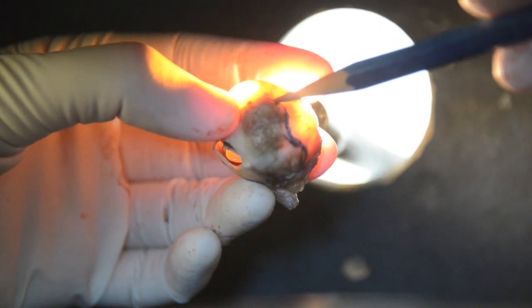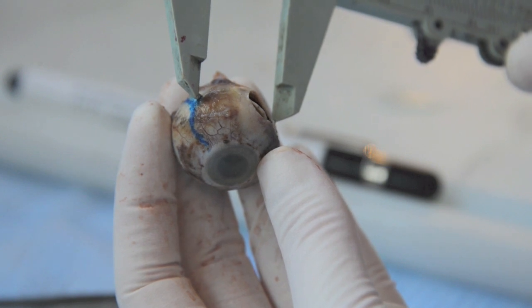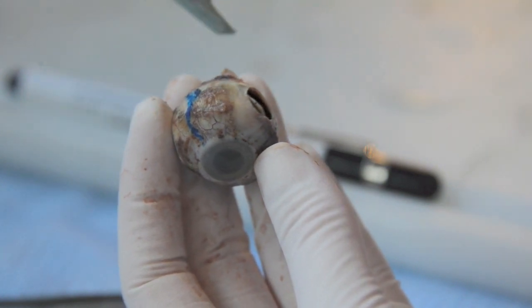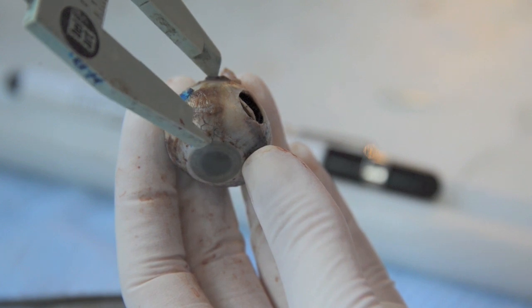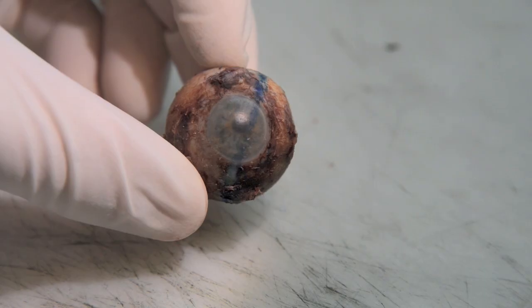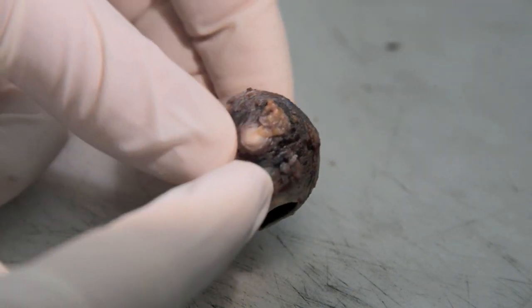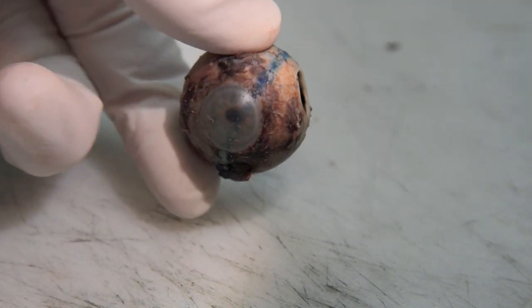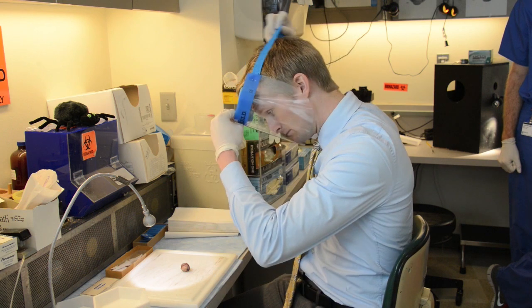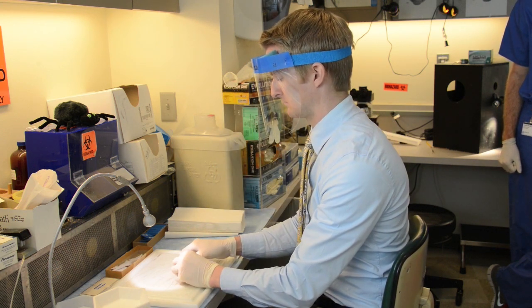The tumor shadow is outlined on the surface of the globe using a colored pencil. The tumor shadow is measured with a caliper ruler. The eye is cut using one half of a double-edged razor blade. Lines drawn on the surface of the globe with colored pencil are helpful aids during sectioning. A face shield should be worn during initial sectioning to protect the eyes from spurts of fixative that occasionally occur.